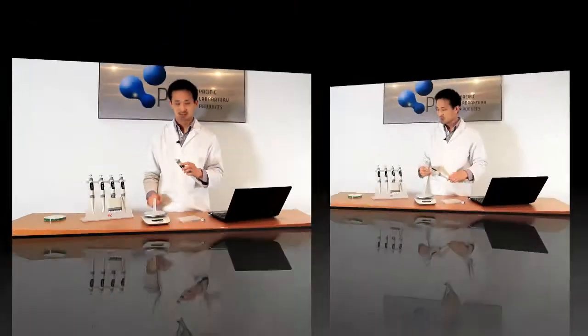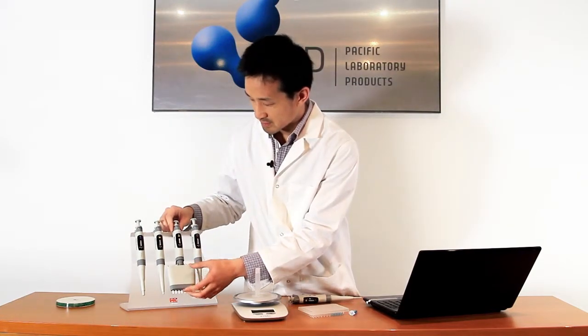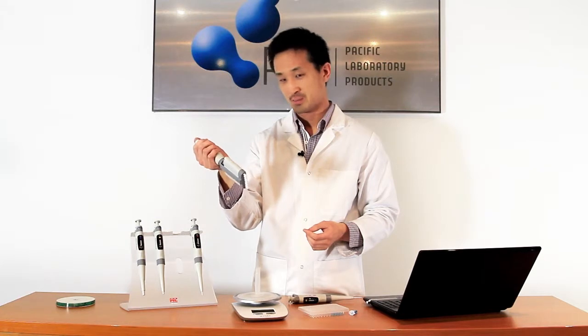It's all in the instructions that come with the pipettes. The HTL pipette range also comes in an 8 as well as 12 channel pipette, as you can see here on the rack.